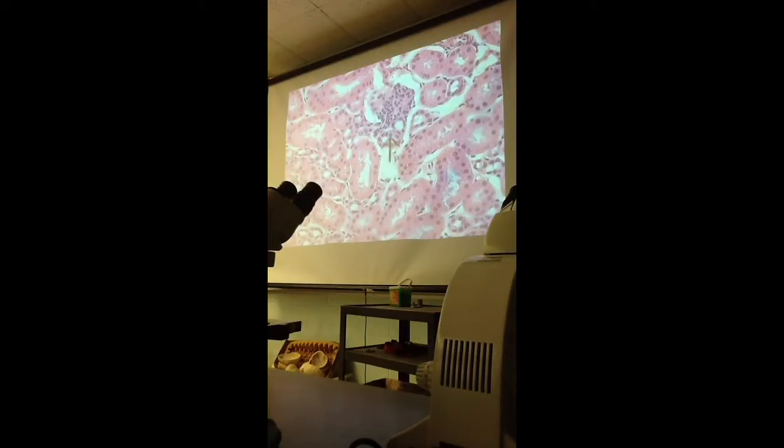I look at this tubule, it's more round and it's not fuzzy inside. And I look at this tubule, it's all fuzzy inside. Again, this tubule, fuzzy inside. Most of the tubules are fuzzy inside. When you look at this one, it's not fuzzy. So it's the distal convoluted tubule. This is all fuzzy because you have the brush border. So this is the proximal convoluted tubule.